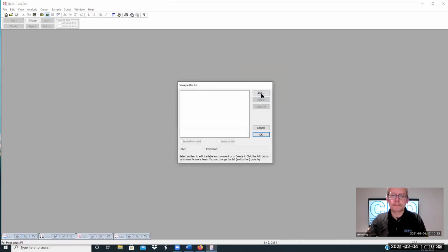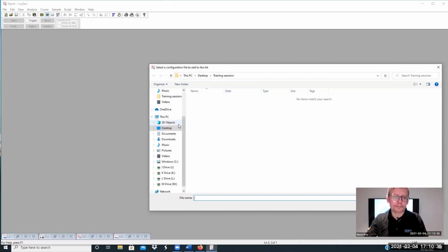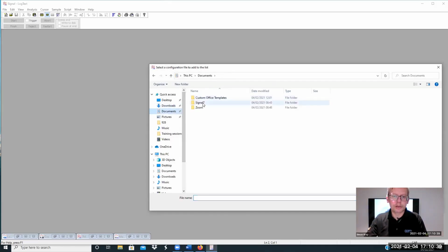Sample bar list, add, we go to our documents, Signal 7, we might have configurations in here. We would add that file.